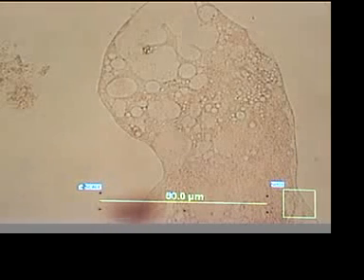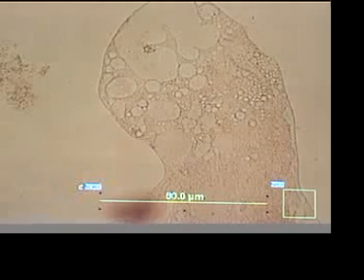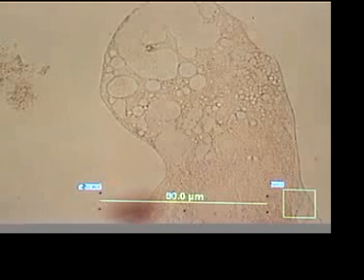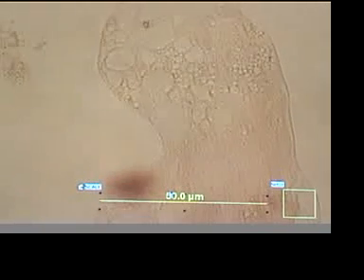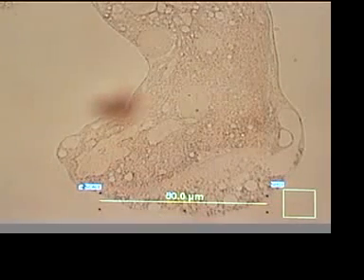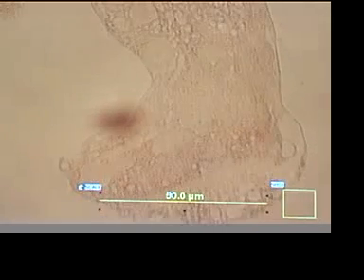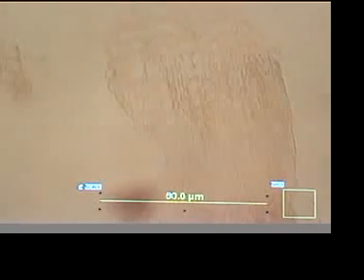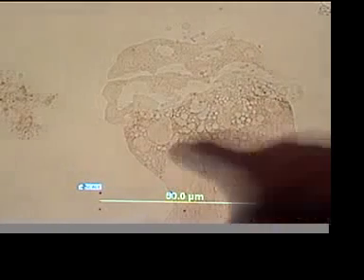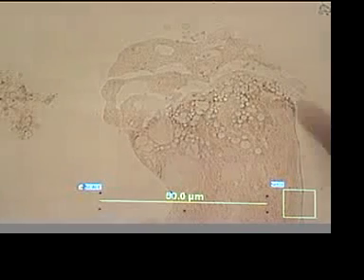We're at 90 watts, SWR 1.2. The frequency is 926 hertz. And let's see if we can get a closer look. This organism is really badly dissolved. And look, the cell membrane, I believe, has ruptured, no? It sure looks like it's, yep, it's flowing out.